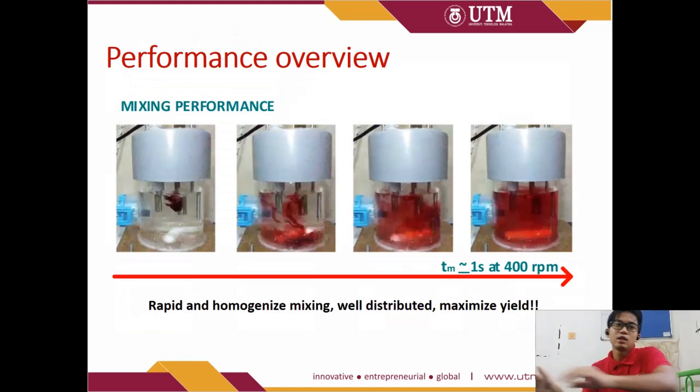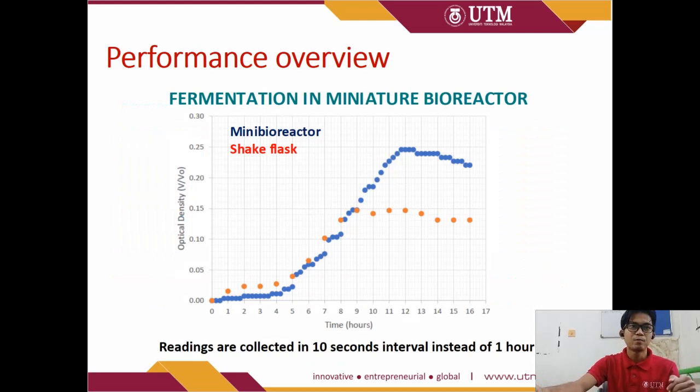Alright, enough with this. I want to talk about the performance overview. Okay, the picture on the screen is a sequence of pictures showing the mixing process. In just 1 second, we can see that the dye is instantaneously mixed homogeneously into the mixture. So from here we can prove that this prototype's mixing performance is rapid, homogeneous and well distributed, so we can hope that it can maximize the yield.